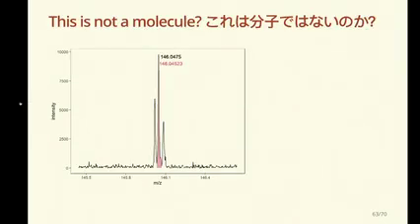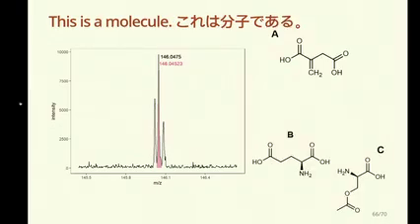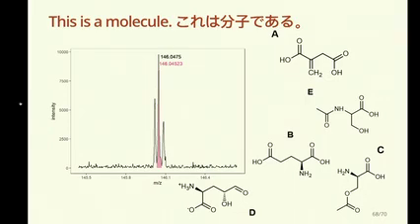So is this a molecule? Can we identify it? I could also go again through the different options, A, B, C, D, and E. Will we ever be completely sure? No, on an MS1 we won't, because of course chemical isomers. I think there are two distinct chemical isomers here, but the other ones are just different conformations. We'll never be sure, but at least we can narrow it down to a handful of molecular formulas and then go more in depth in a traditional metabolomics sphere.